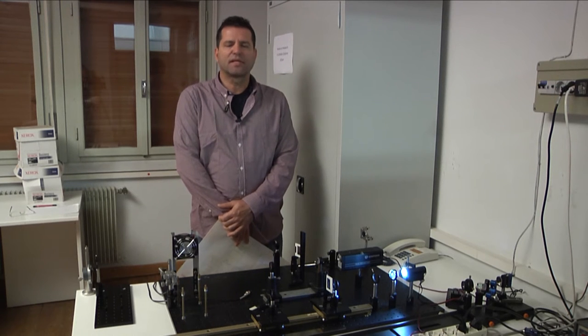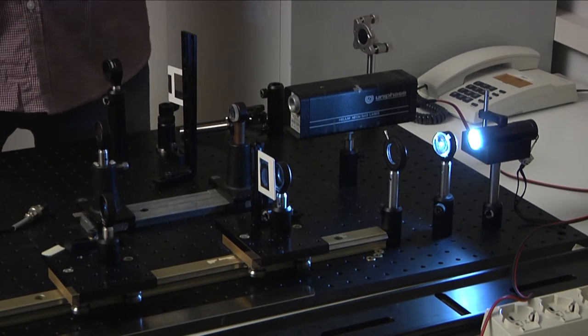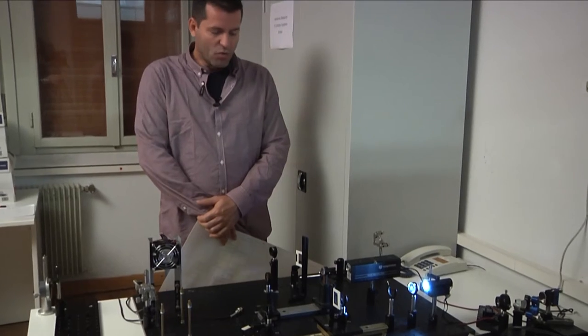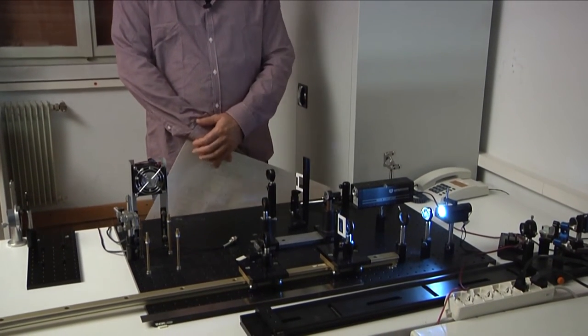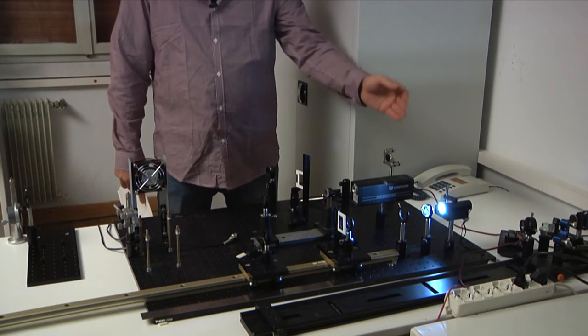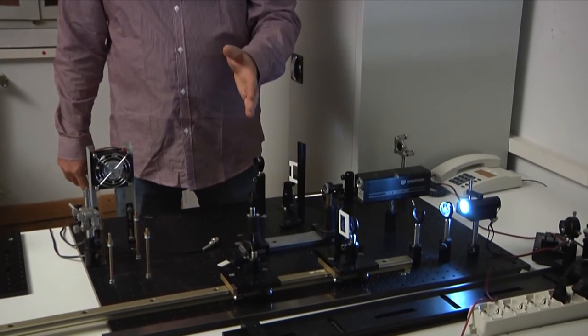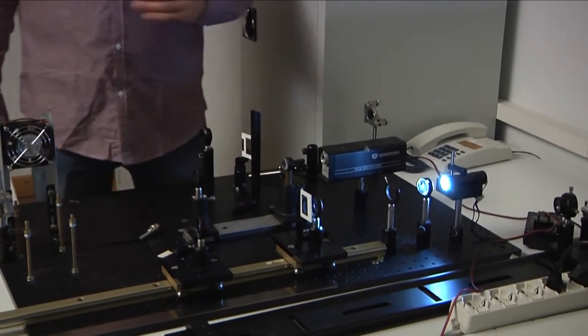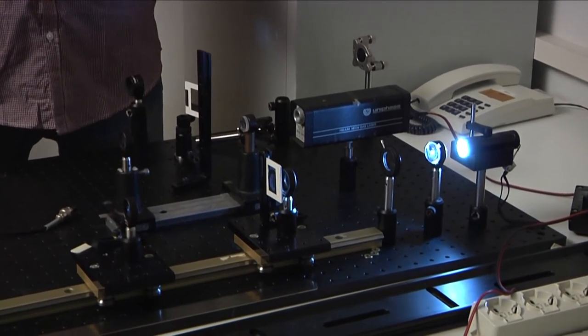Advanced Optical Techniques for Bioimaging. Now I will present an experiment in which students will have the possibility to play with the color illumination, collector, condenser and objective lenses, and also play with the lens maker equation.